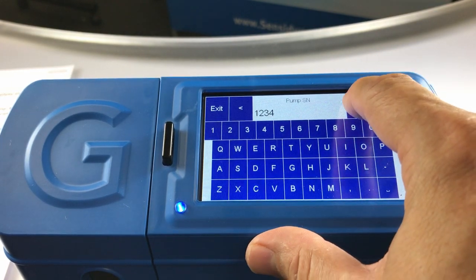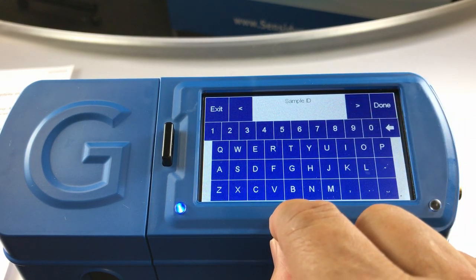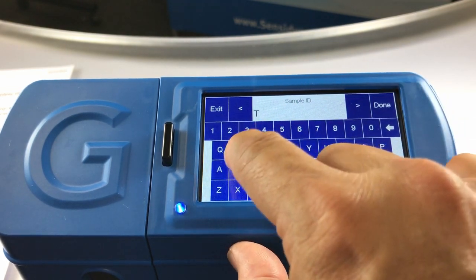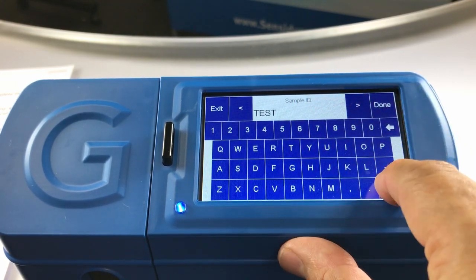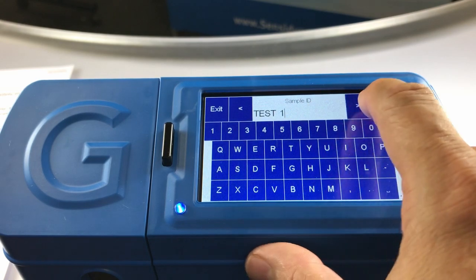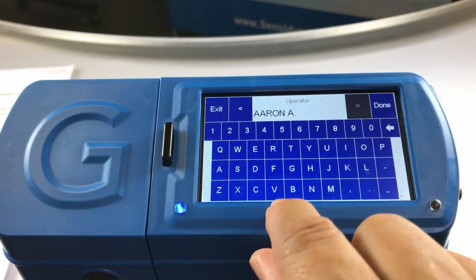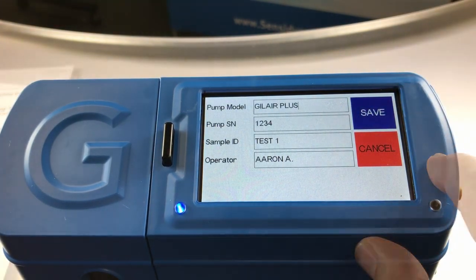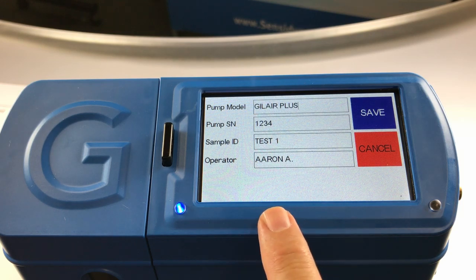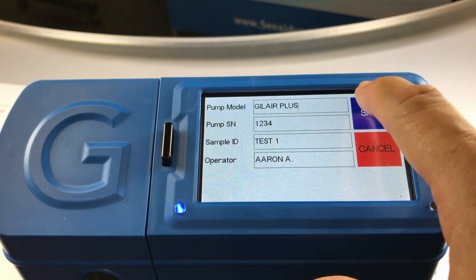Hit the next arrow and the sample ID will appear. We will call this sample test one. Hit the next arrow and the operator ID will appear. I put in my name, Aaron, and hit done when complete. The record input screen will reappear with your entered information. Review the record detail information; if correct, touch the save window.